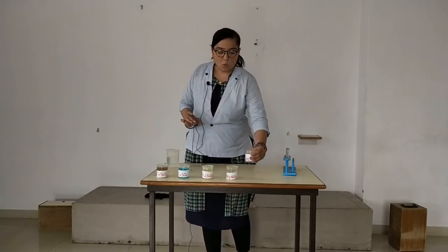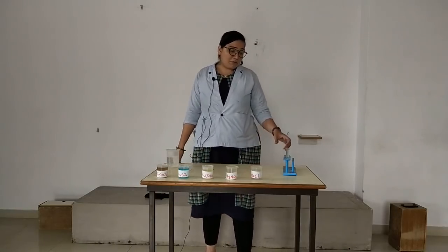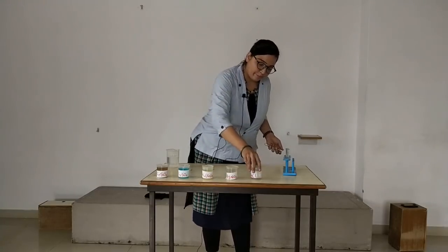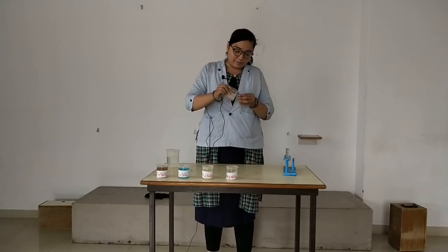Now we'll see one by one how the reactions occur. The very first one is this sodium chloride with AgNO3. A little bit of sodium chloride I'll add to this beaker.